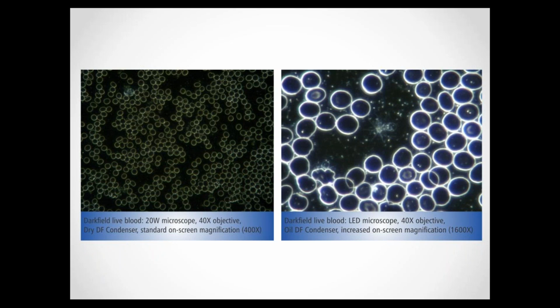Well, supply and demand plays a role here. Microscopes that are mass-produced are usually much cheaper, but these all tend to have the same standard specifications that all normal laboratory microscopes have, and none of these are really suitable for live blood analysis. Where a microscope has been manufactured also plays an important role.